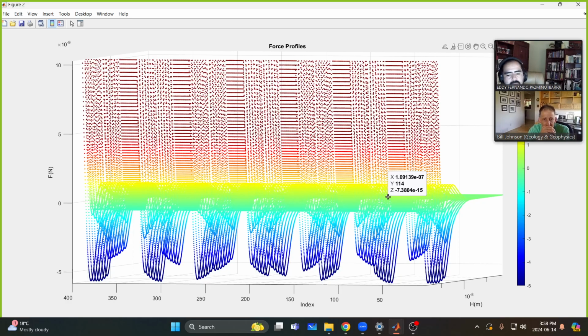And what we hope to do with the real system, if you do this rastering, is you're going to have all these distributions of forces, and we try to represent this from fundamental principles. That's one of the utilities of this module.